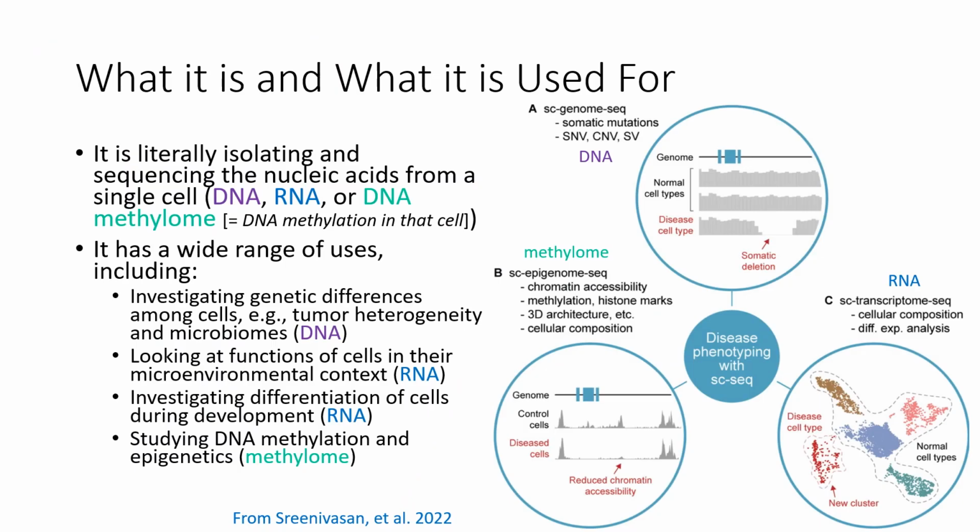Single-cell sequencing is exactly what it sounds like. It's sequencing the nucleic acids from individual cells. It can be used to compare genetic differences in DNA across cells, for example, changes in tumors relative to the surrounding cells. It can also examine the function of cells in their microenvironmental context by studying gene expression, or RNA, study the differentiation of cells during development, or study DNA methylation and epigenetics.